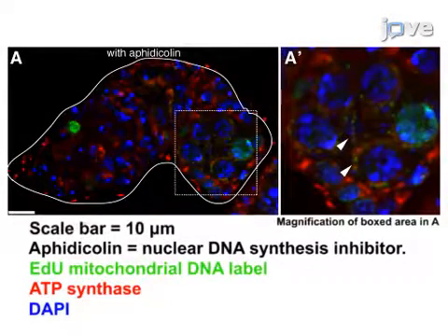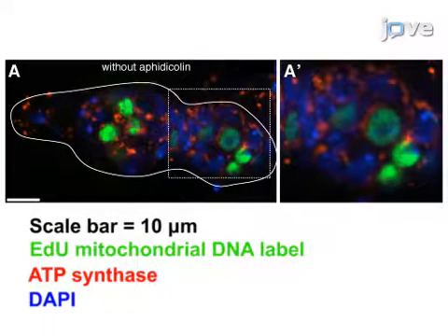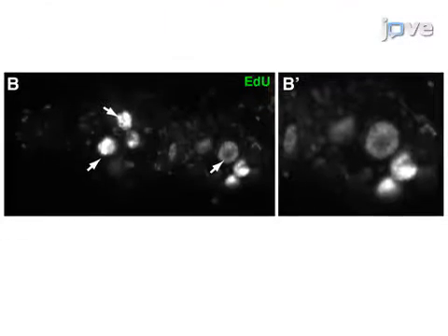Here, mtDNA replication in the Drosophila germarium is visualized by EDU incorporation in the presence of the nuclear DNA polymerase inhibitor aphidicolin. Under these conditions, nuclear incorporation of EDU is shown to be reduced and many puncta were localized within mitochondria. In the absence of aphidicolin treatment, mtDNA replication is detected at a very low level in the Drosophila germarium. A confocal section of a wild-type germarium shows intense EDU incorporation in the nuclei, with mtDNA puncta barely detectable.